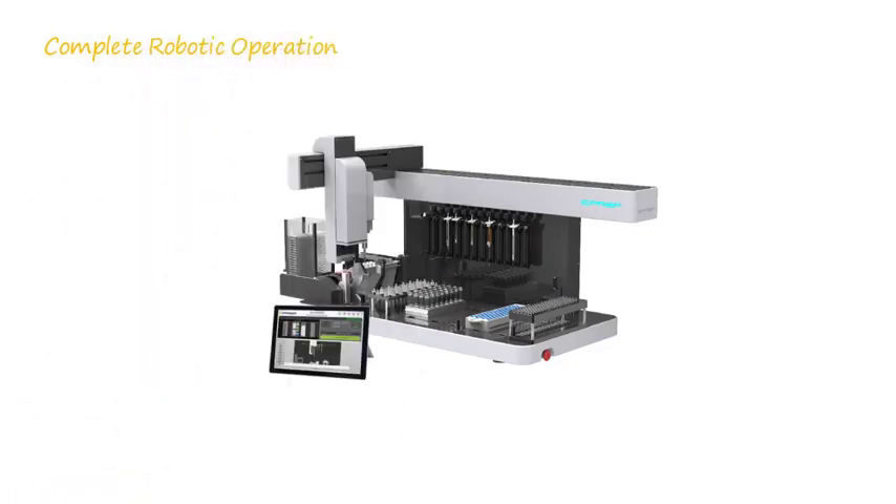The ePrep offers complete robotic operation and unattended operation. This is the ultimate efficiency, allowing highly skilled analysts to concentrate on delivering results.